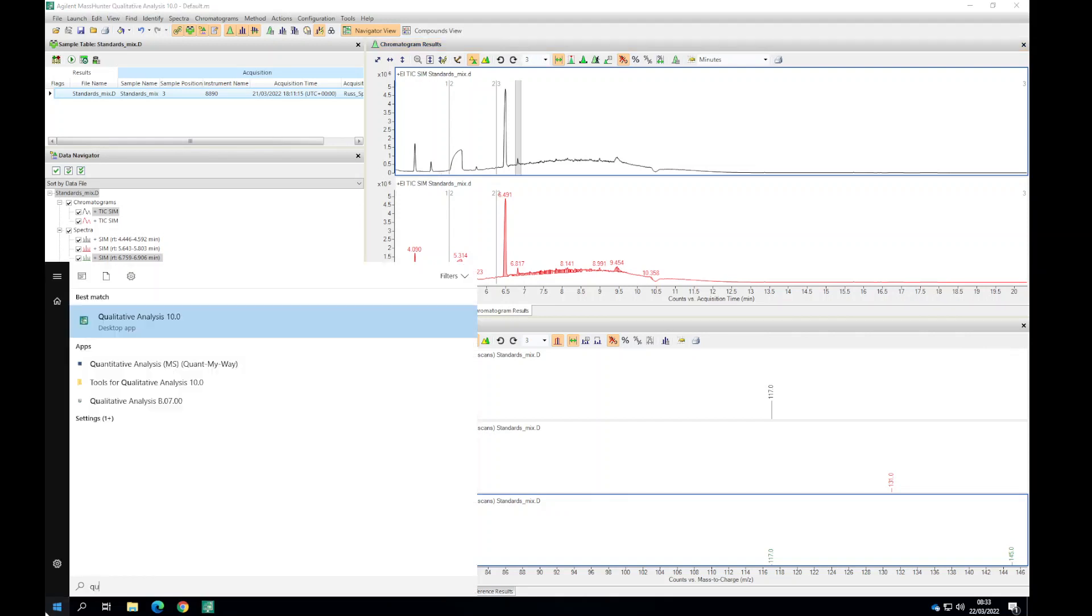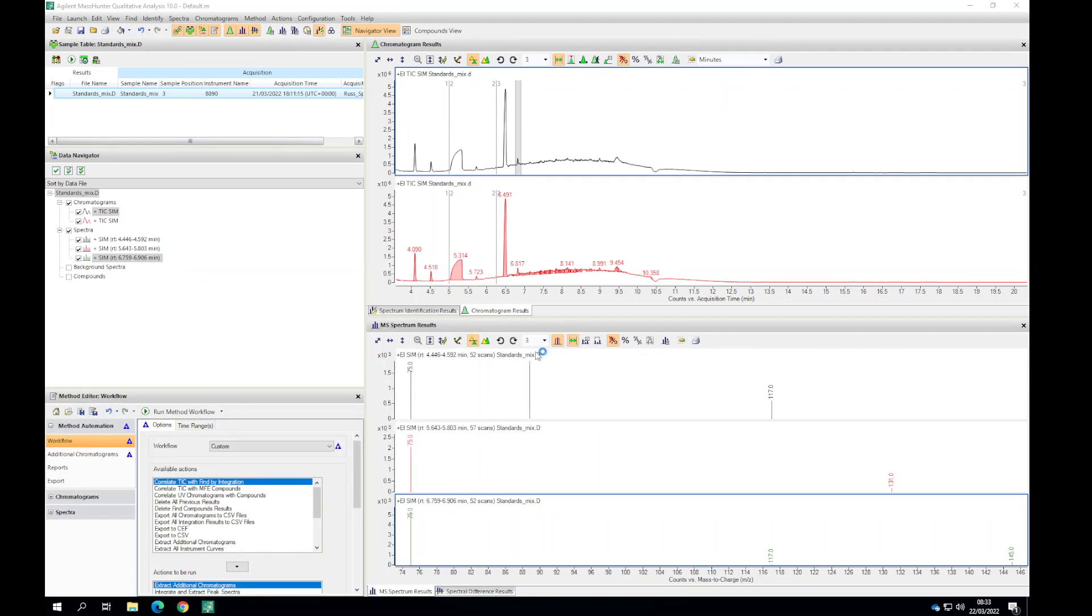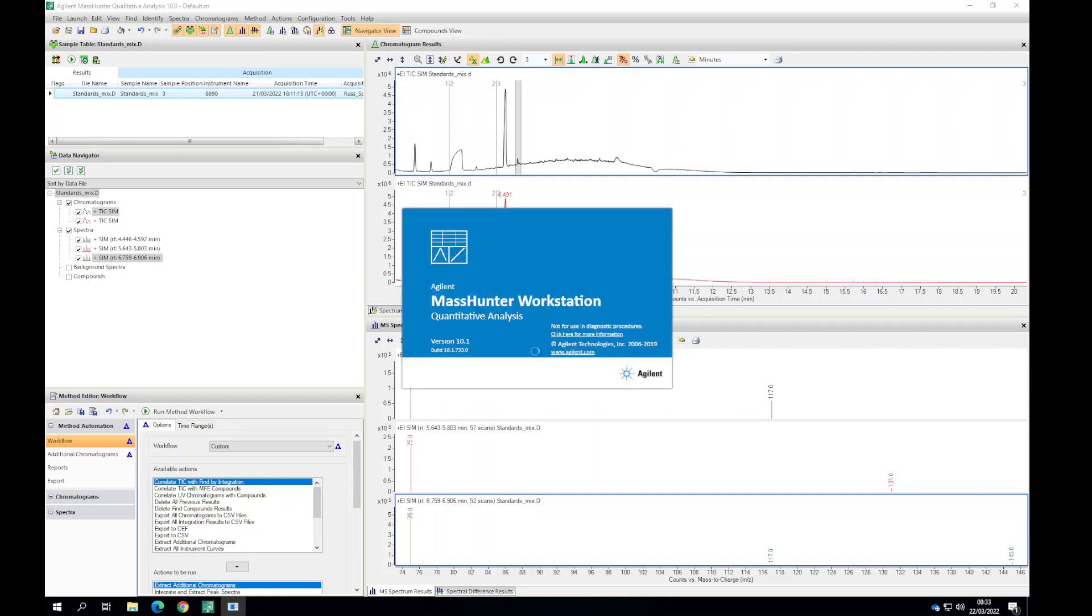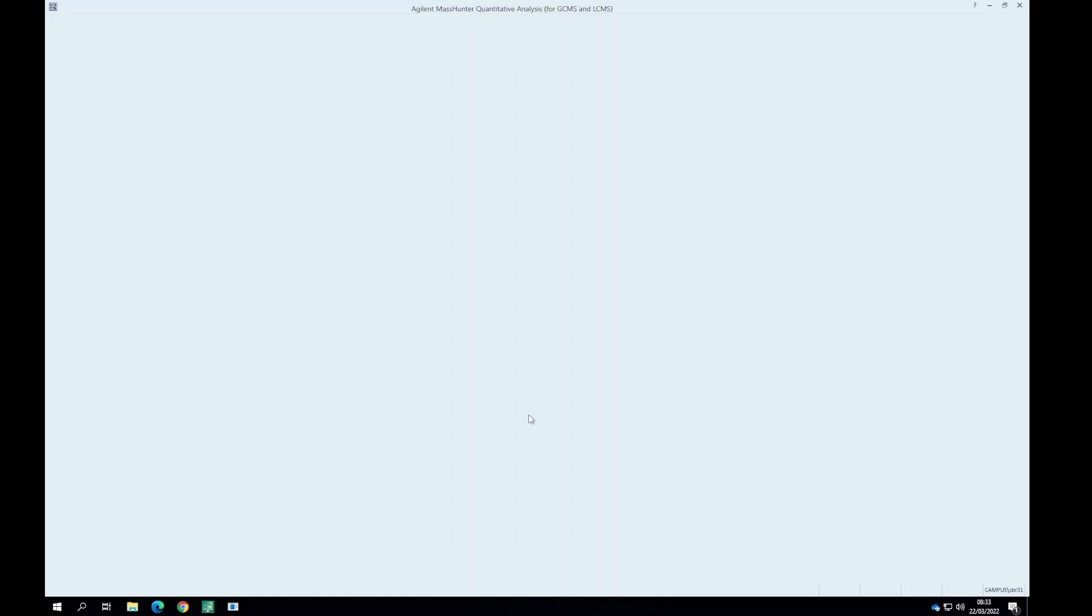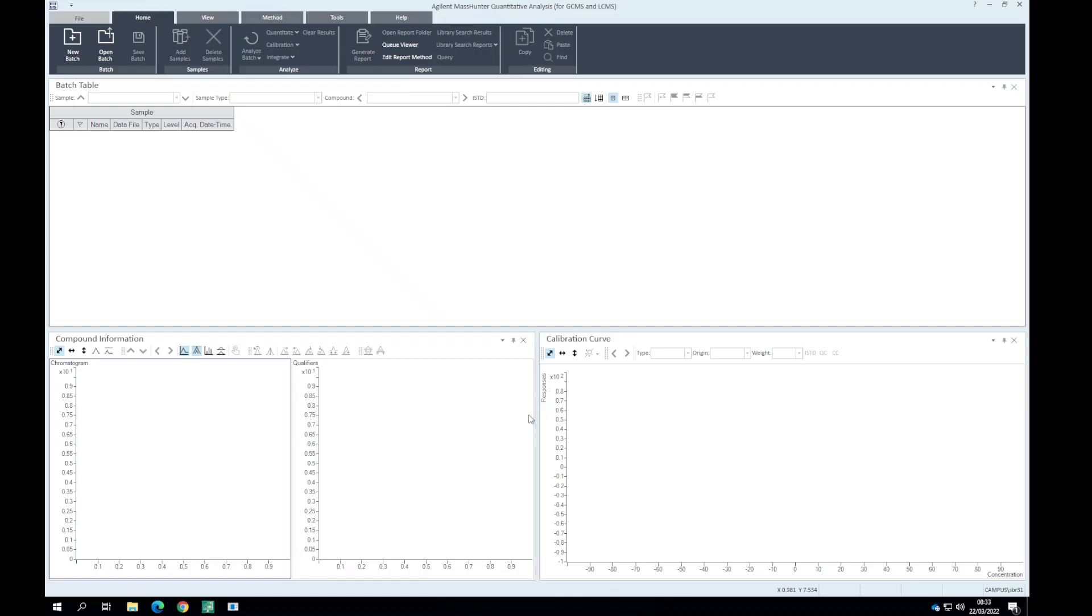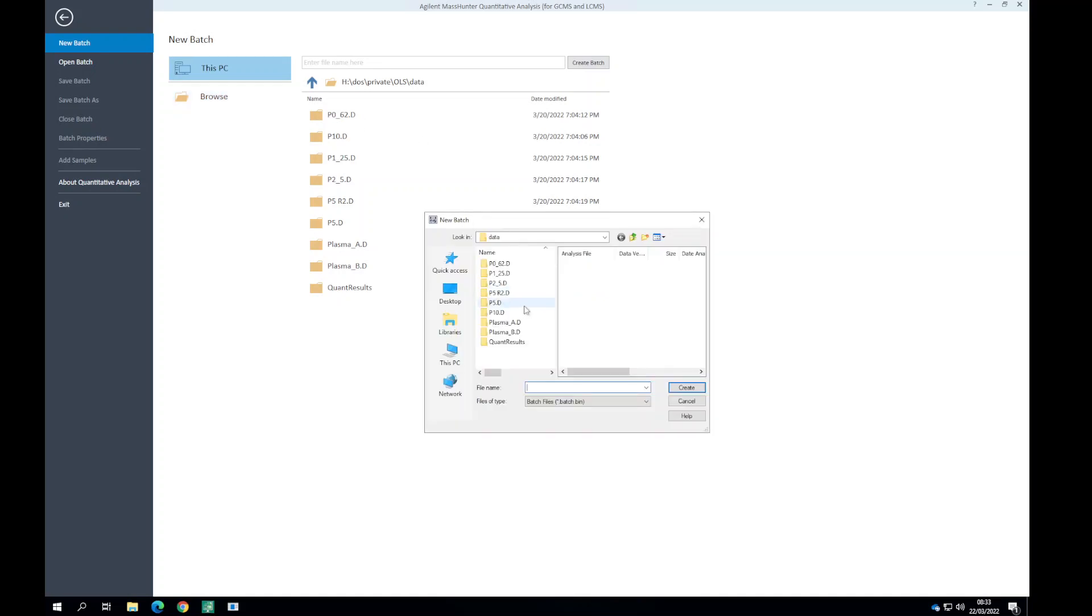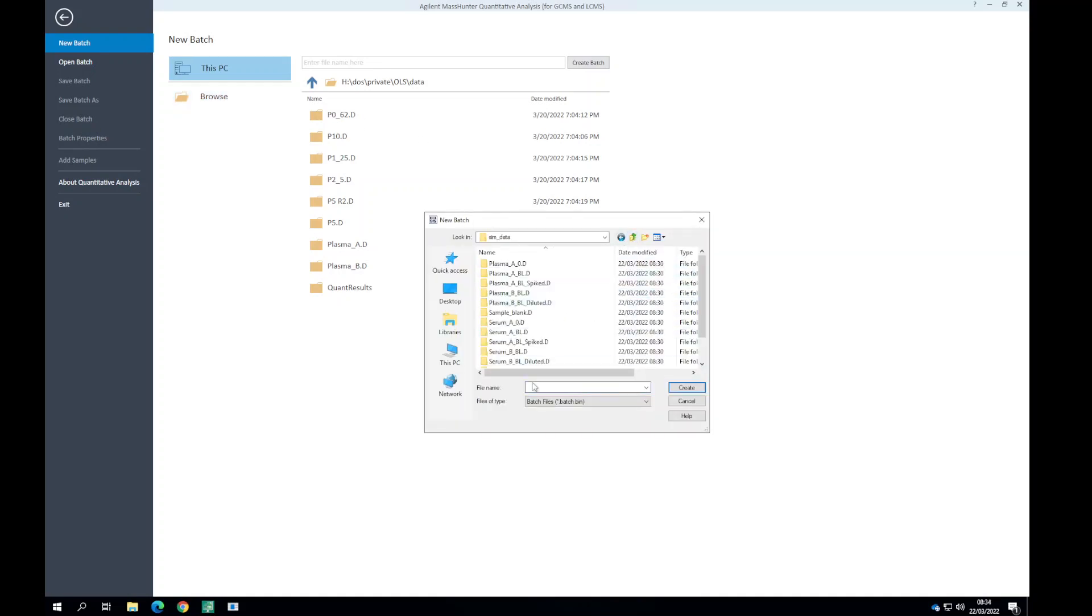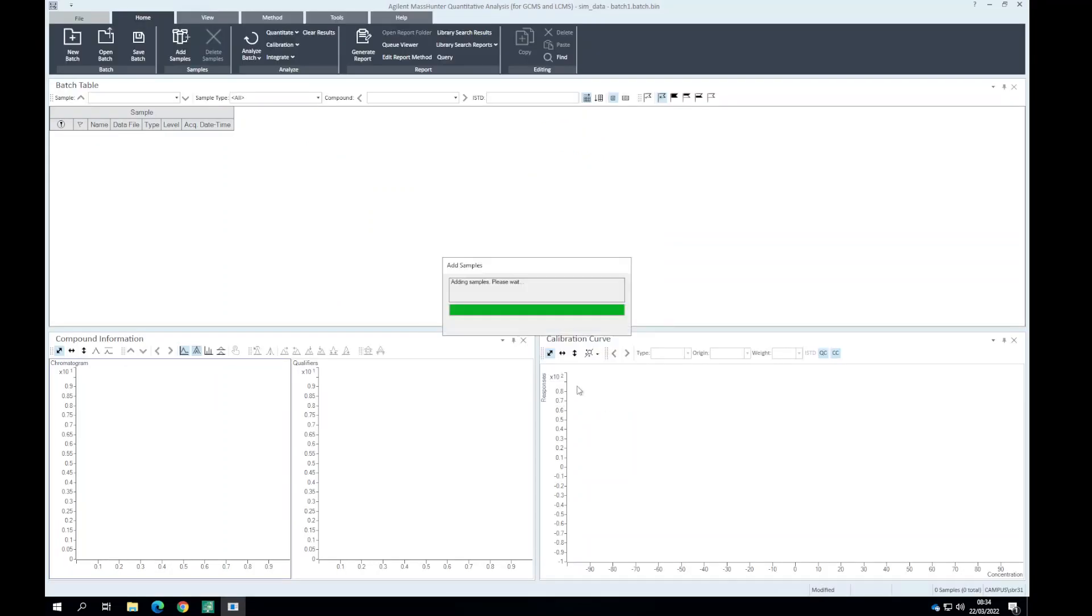I'm going to start the quant method by opening the quantitative analysis, and then from there we can build in qualifier ions and ensure there's good qualifier ion to quantifier ion ratios as well. I'm going to create a new batch in my simdata folder and importing all the samples in that folder.